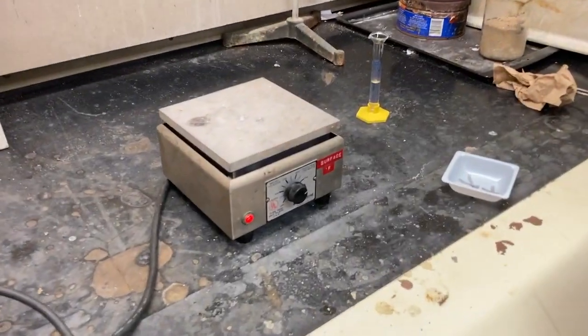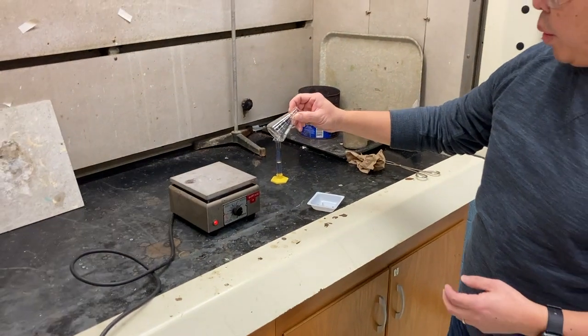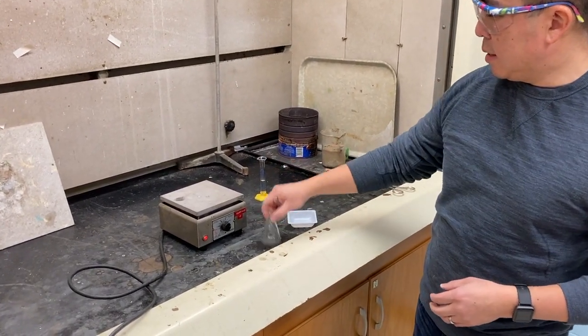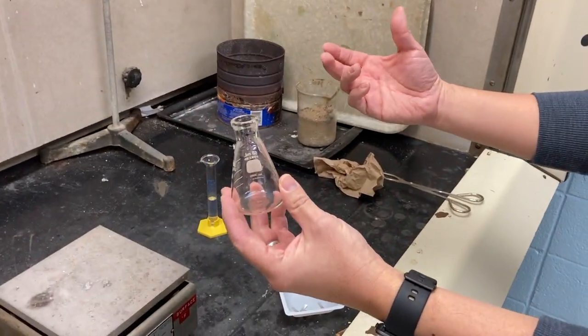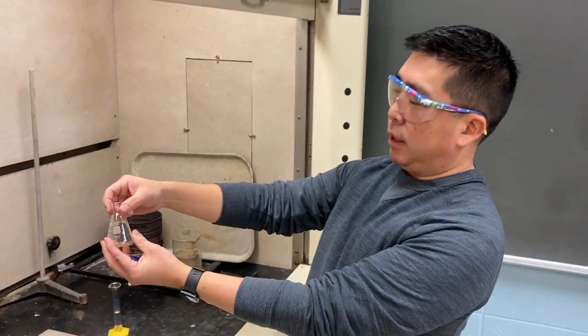Okay, so we got, oh, looks like a hot plate. This is the hot plate. And here's our flask. So we want the magnesium to react with the hydrochloric acid. So the reaction is going to take place. It's going to produce hydrogen gas, which is why we're in the fume hood, because we want the gas to leave. We don't want it to build up in the lab.